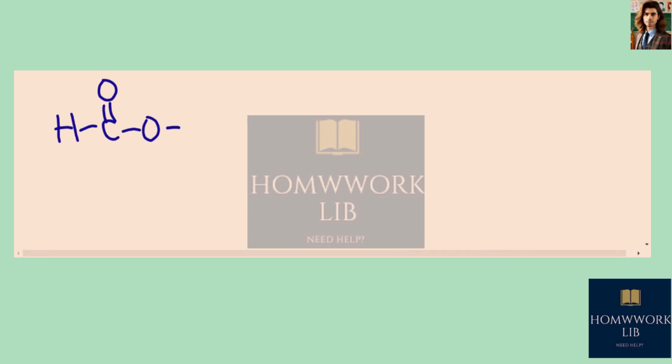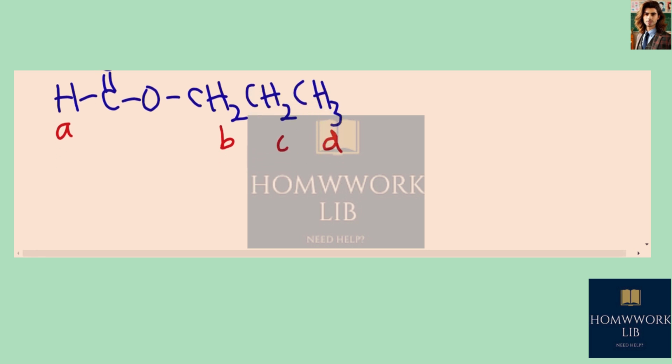And then we have one last ester to look at. Like I said before, this will just be an ester that has a linear propyl group. We looked at the branched propyl group before, and now we can have the linear version. So again, this will give us a unique signal. And this and this will give rise to separate signals. So this is the only ester that's going to give rise to 4 signals, so it should be easily distinguishable from the others.